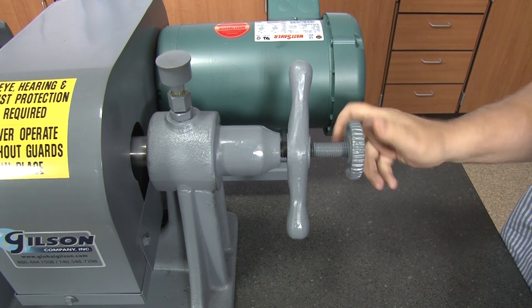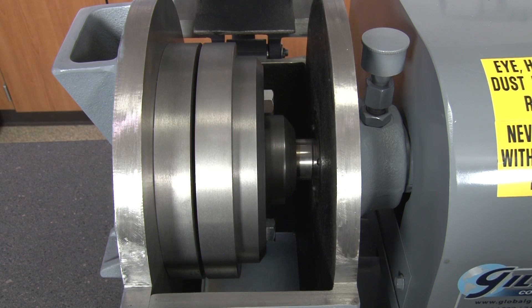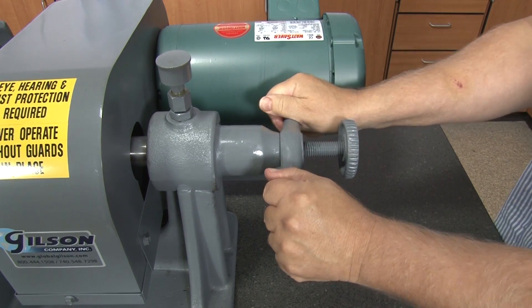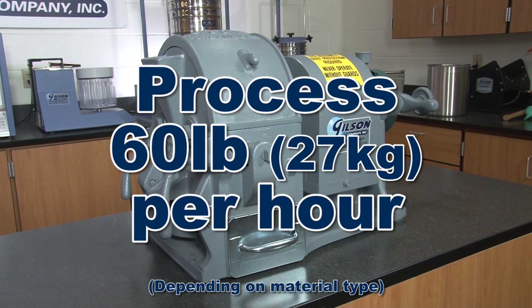A threaded knob with a locking lever adjusts the gap between the two 8-inch diameter grinding plates to control the particle size output, and the LC53's throughput is about 60 pounds per hour depending on material type.